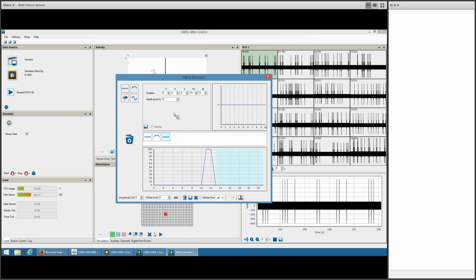They can be rather complex, and what you have to keep in mind is that the stimulation principle is different in comparison to the classical arrays. So what happens when you do a ramp like this on a CMOS chip is that a positive ramp going up means you induce a negative current. So something like this will mean that you get a negative current pulse as long as this is going up, no current while this is 0, and a positive current while this is going down.